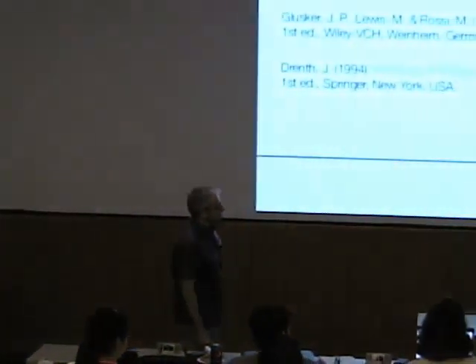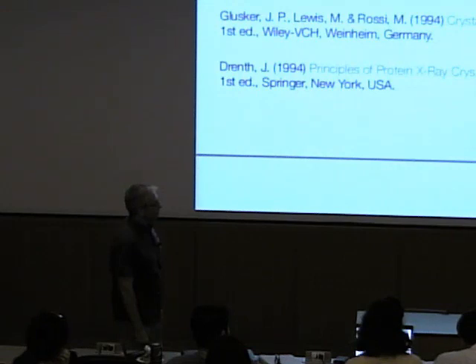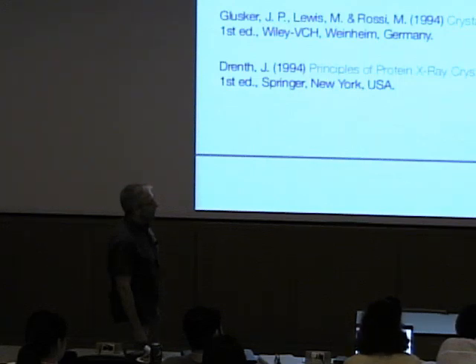So in a lot of metalloprotein structures, if you look at certain forms of the electron density map, you'll sometimes see these ripples of negative electron density around the metals. And I think this is something that we even see in one of the data sets in the practical. Can you comment a little bit on why we see that?